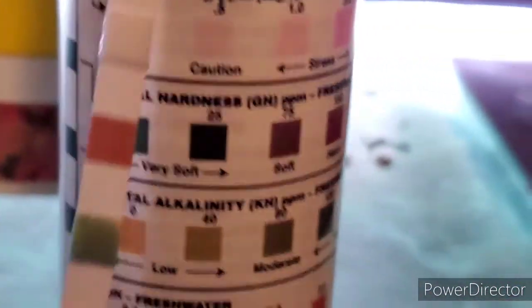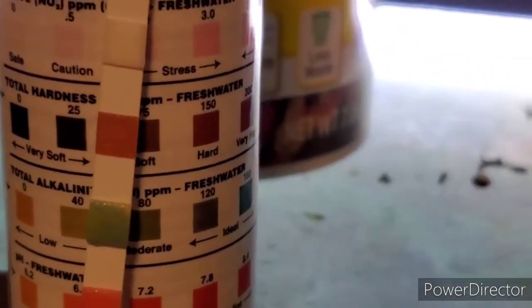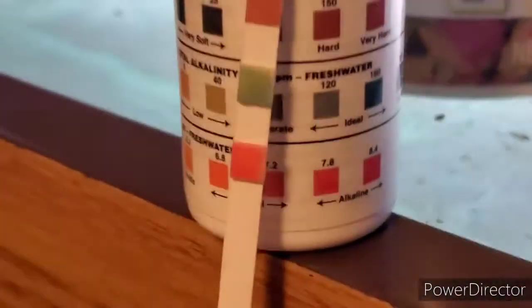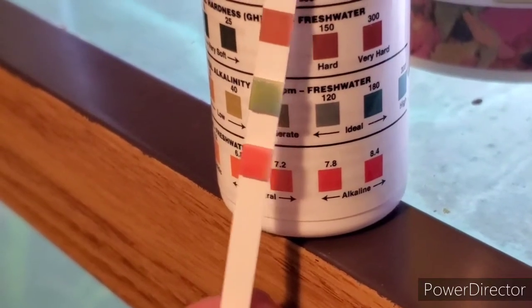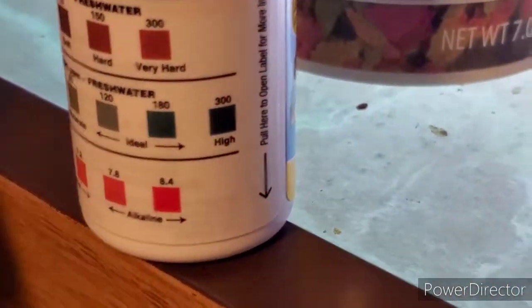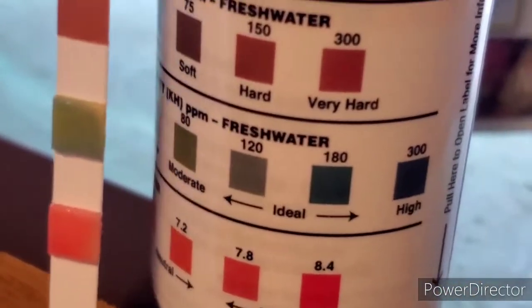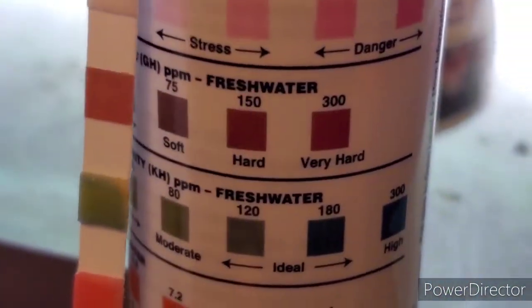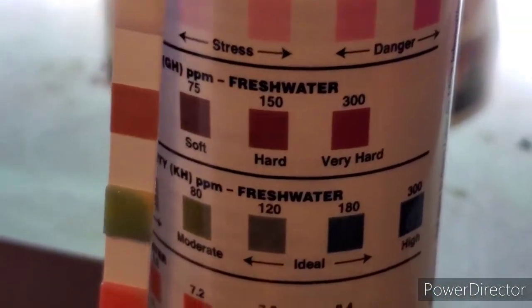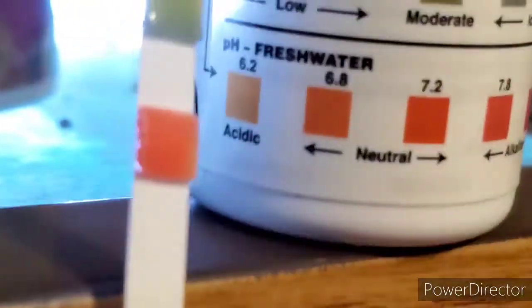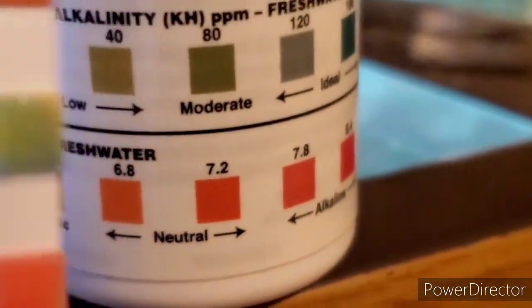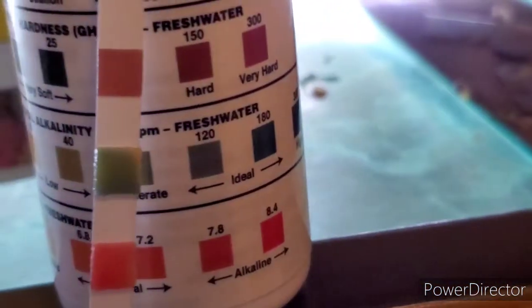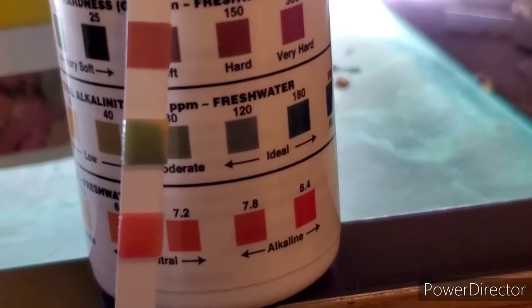Than alkalinity, which is about, let's see, let me twist it. So, my KH is about 80, and then, let's see, my pH is about 7.2.